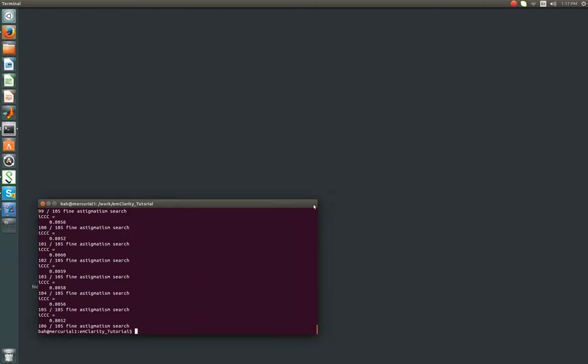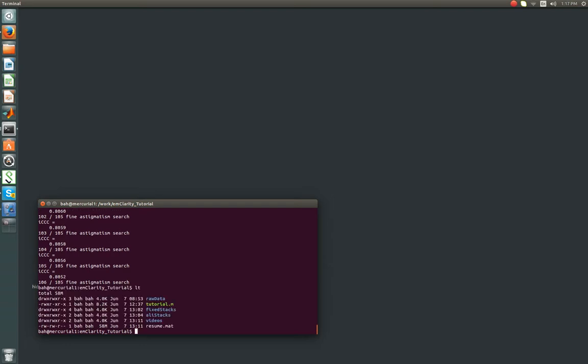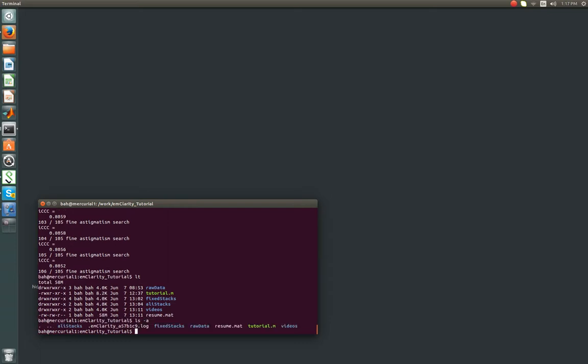Alright, now this will have printed out a bunch of stuff to your terminal if you're running interactively on your own desktop, and we'll end with the astigmatism search. So the log files that emClarity saves are hidden to prevent clutter, which you can show them if you do ls with the a tag. It'll show hidden files which start with a dot. So this is a log file, and it contains everything that just printed out on your screen. In most cases you aren't going to probably need to look at that, but that will help troubleshooting if you run into bugs down the road.